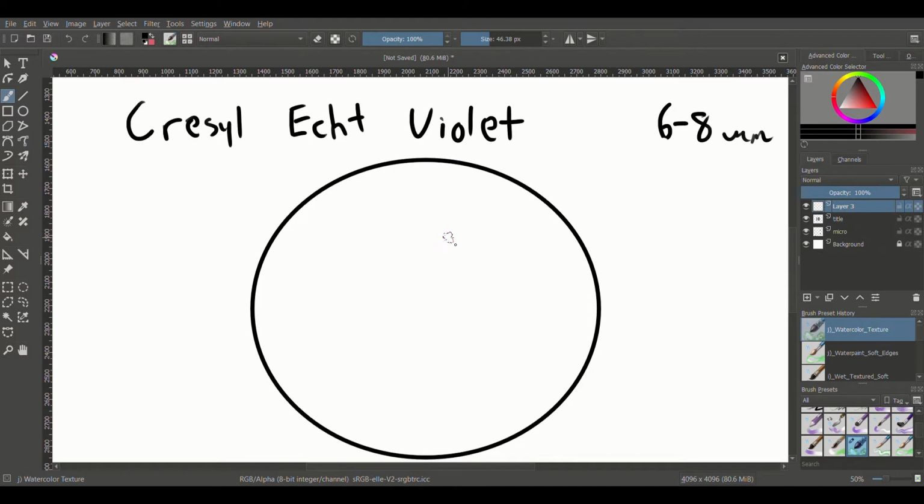A lot of times what you use for a control for this is spinal cord, which luckily with neurons, you're not going to see nuclei bunched together if you cut it at the correct thickness. So it's not as big of a deal as you might think to find something else as basic amongst other basophilic constituents. But we are going to use a little technique here to add that contrast.